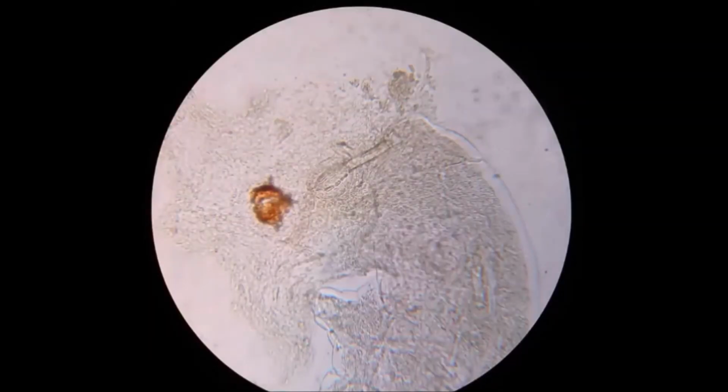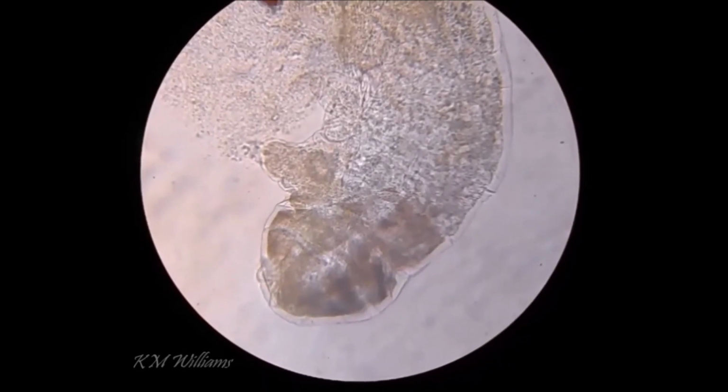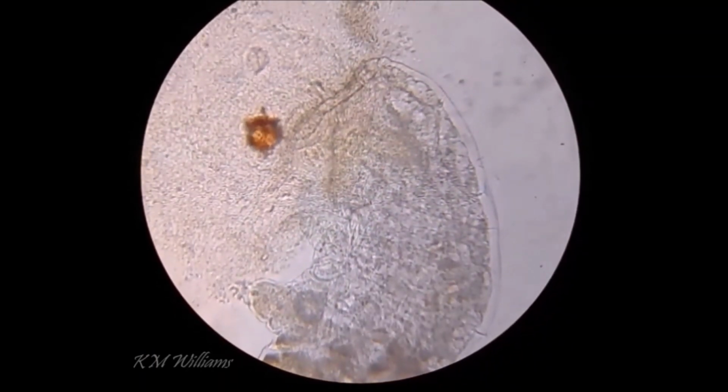So at this point, it kind of looks like a horror movie. The tardigrade's head has basically exploded. And so I thought it had died, but then I noticed there was still some leg movement happening. So it really took a long time for death to occur.